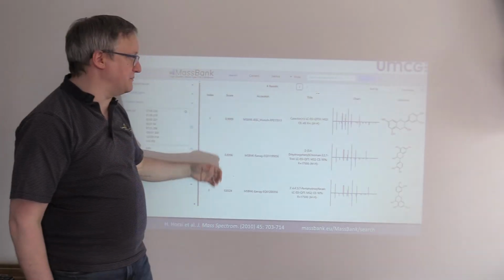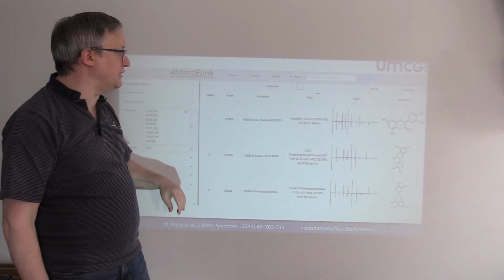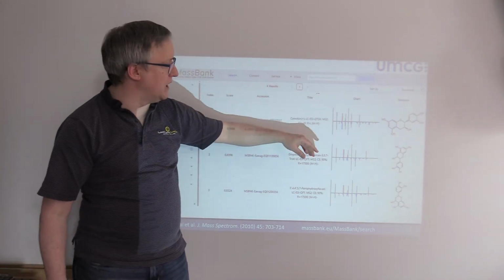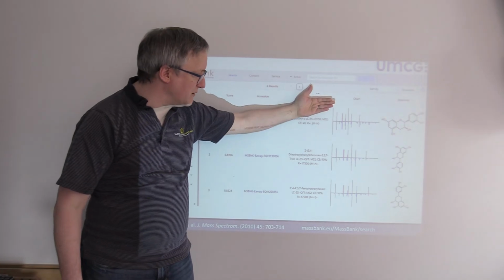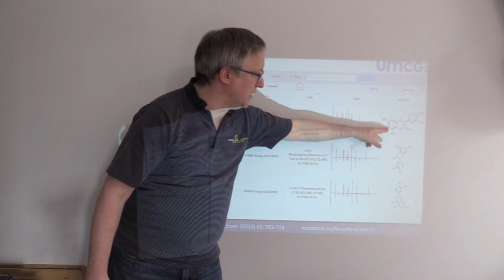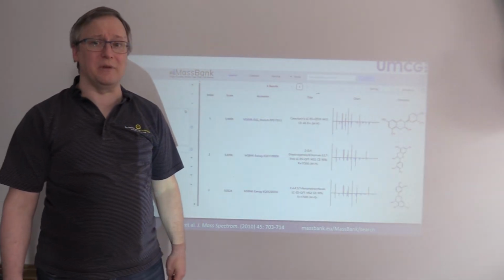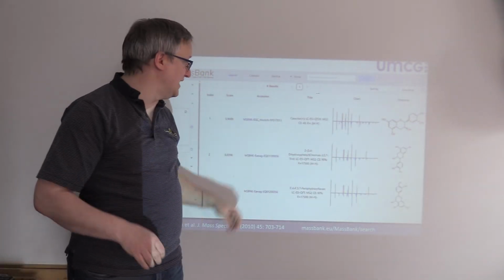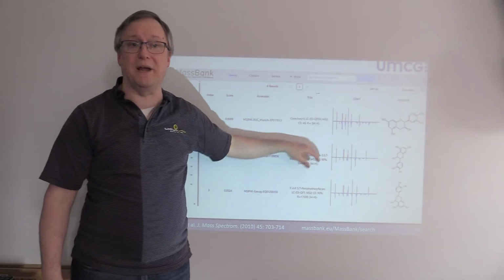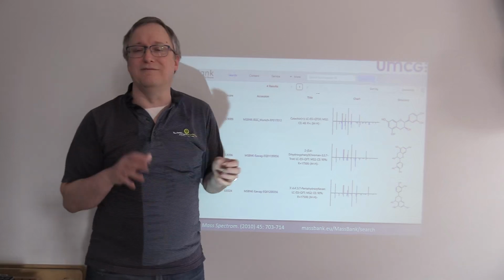I wanted to mention MassBank again. Here's massbank.eu giving us some results back. Again, we're getting this mirror view where we have the observed fragments up top and the reference library down at the bottom. And we're seeing, in this case, a molecule that shows up in my favorite beverage, tea. The catechins are different types of phenolic compounds that give tea some of its yum.